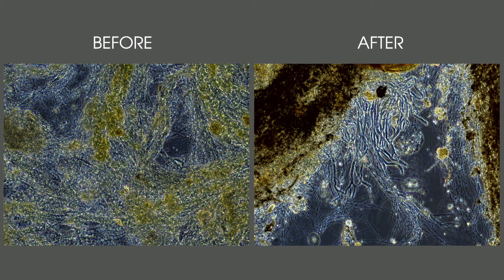While there should have been nothing on the backside, the permeate side of the membrane, we found a thick agglomeration of filaments and zooglia, which are signs of stressed plant conditions.